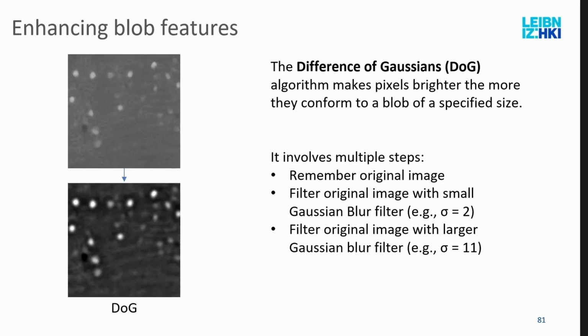We push it up compared to the background, and then this way, when we want the glomeruli, an auto-thresholding algorithm, when you set the correct one, maybe one that's a bit more lenient, like Huang, it will definitely find most of the glomeruli that you are interested in.